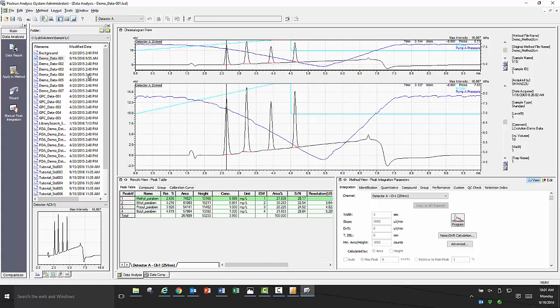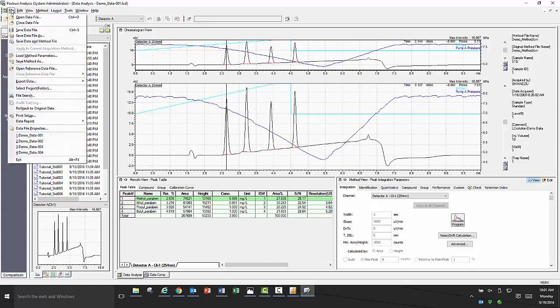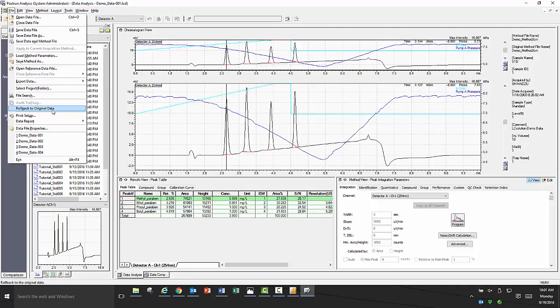Another great feature within LabSolutions software is the ability to roll back data to the time it was acquired. If for whatever reason, during the course of processing the data, like changing the integration parameters or quantitating through a method file, if you would like to start over and roll back the data to at the time of acquisition in order to reprocess it, you can.